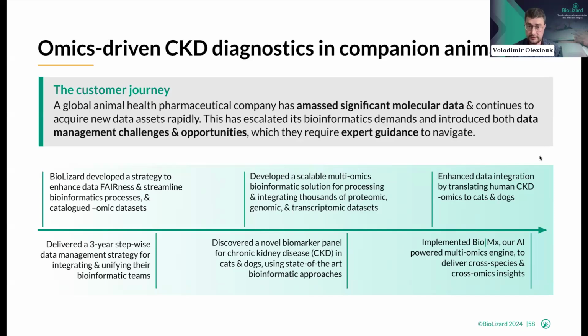What is important as well is to really understand that you have those different perspectives from those different technologies, but also each technology comes with its own biases, shortcomings, and preferences. In a very simple example, when you're looking at bulk transcriptomics and bulk proteomics, even from similar samples, you will typically find a 40% difference in results or trends between both technologies, as they capture different pieces of biology, they operate on a different level, but also from a technical or technological perspective.